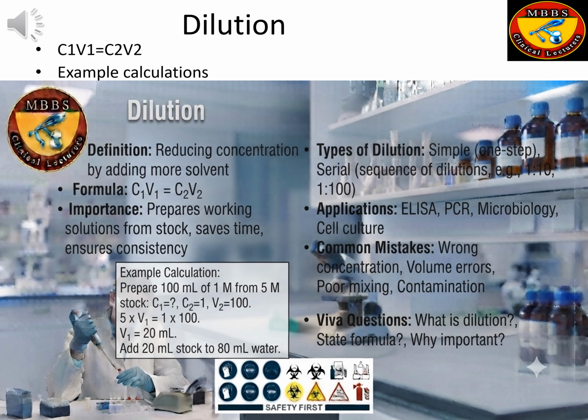Safety tips. Always use calibrated pipettes. Wear PPE. Use clean glassware. Label diluted solutions immediately. Viva questions. What is dilution? State the dilution formula. What is serial dilution? Why is dilution important? Key takeaway. Dilution changes concentration but does not change the amount of solute.